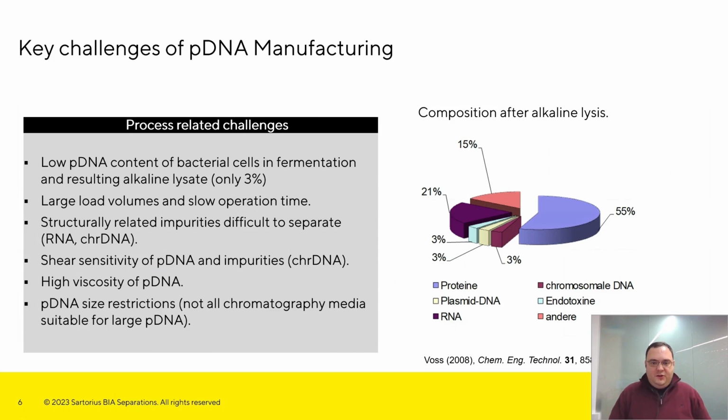sample, such as proteins, RNAs, chromosomal DNA, and other nucleic acid species. Now, all of these have absorption and can interfere with your measurements, especially early in the processing, early in the process stage.